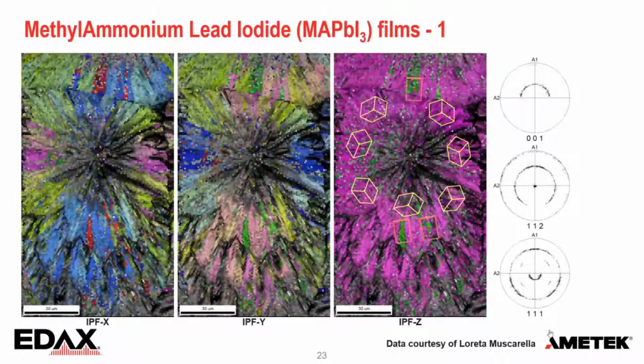If you look at a different direction, the pinkish one here on the right, that's the crystal direction sticking out of the sample, looking at you. And the other two are, this is the vertical axis, and this is the horizontal axis. So axis 1 is X, axis 2 here is Y. And you can see also here it's beautifully symmetric, where the different orientations can be reliably differentiated.